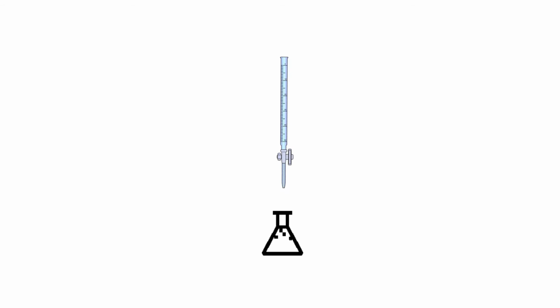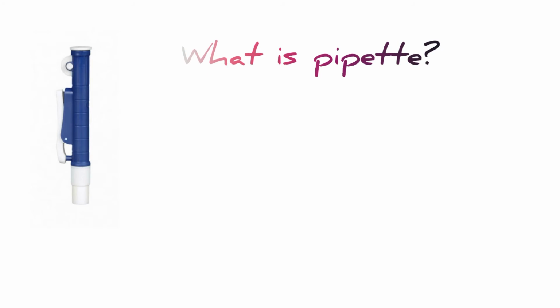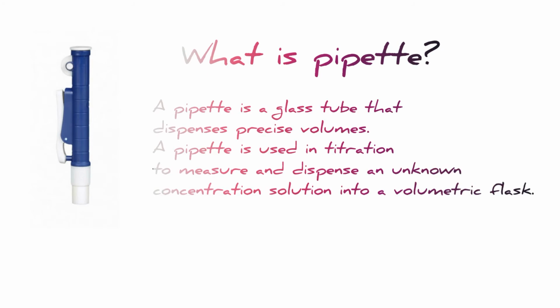Step 3. Parallax error should be avoided. Read the burette at eye level at all times. Show how the volume changes as you look at the meniscus from three distinct angles: above, at eye level, and below. A pipette is a glass tube that dispenses precise volumes.